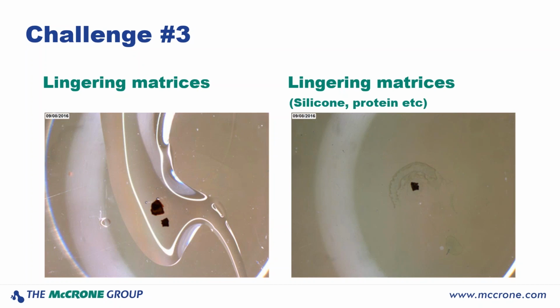So we'll wash these off with appropriate solvents. In the case of silicone, we'll use hexane or nonane. And you can see here from the image on the right just how much oil can be retrieved from a particle that looks like it was clean to start with.